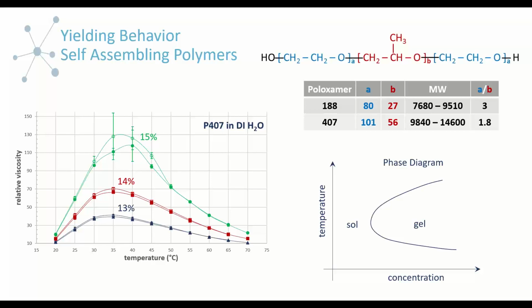There are certain cases where artifacts are surprisingly consistent, but in the case of yielding, I would say that it tends to follow that pattern, that it's an inconsistent response. So what we can expect here is that we have different degrees of yielding depending on our data point, which gives us this irreproducible behavior in these large error bars.